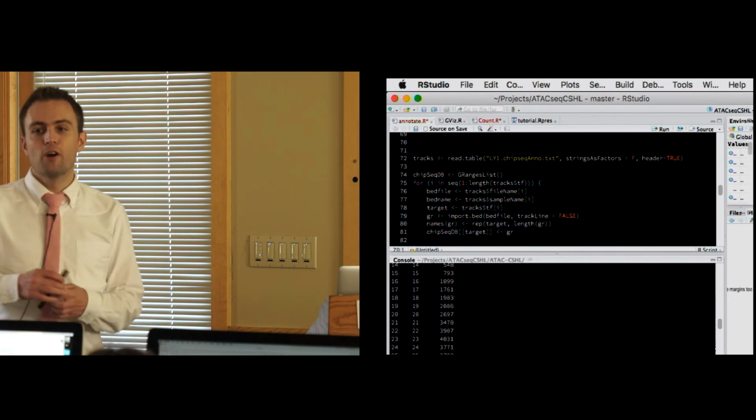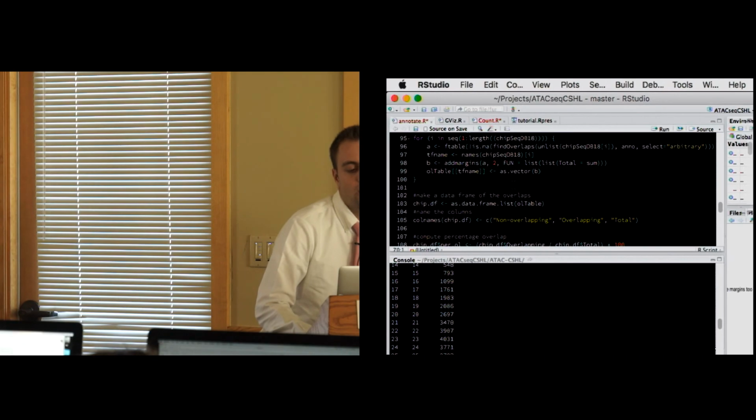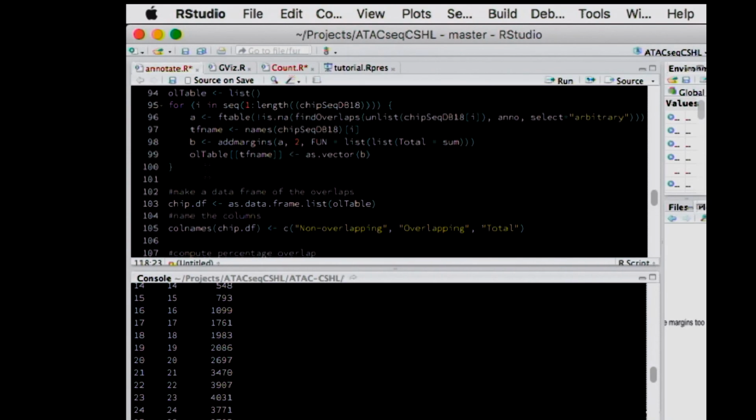So the next line of code is basically this next bunch of code. You should be able to just run it all if you want, or we can go through any of the code. What are you guys interested in? Details about the code, or more like what the result looks like? And I don't know what the code is. Okay, cool.